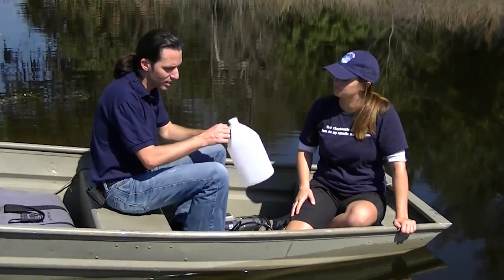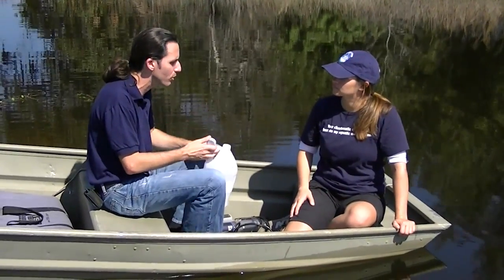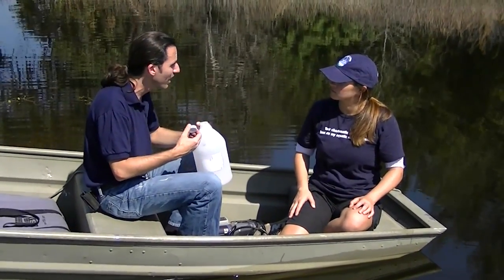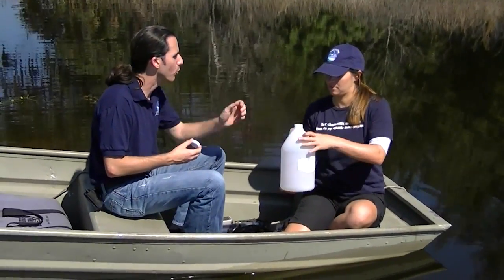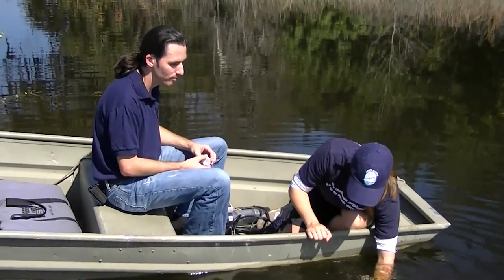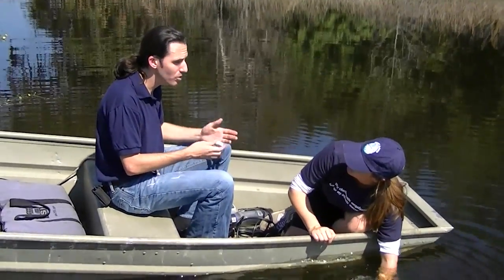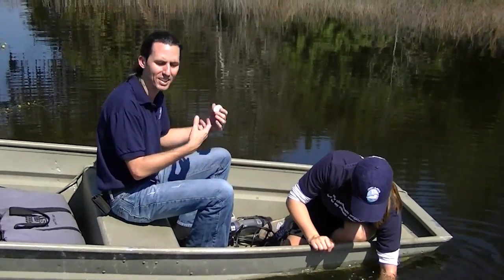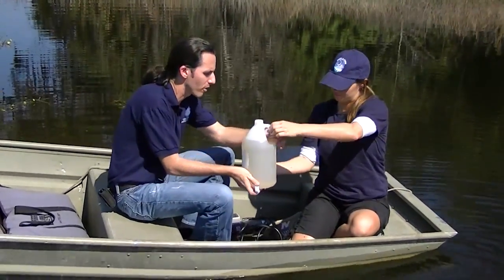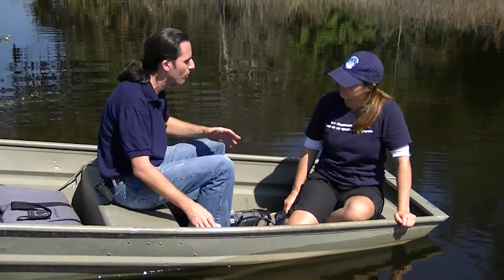We also filter a sample for chlorophyll A, so we have to filter algae out of the water. We have an apparatus to do that, but it's kind of hard to do on a boat when it might be moving. So what we recommend is you just take an empty, clean jug like this and fill it up with water, then take it back. Milk jugs or two-liter bottles are great — anything that didn't contain anything toxic and has been well rinsed so there are no residues that might influence the chemistry. About a gallon should be plenty.